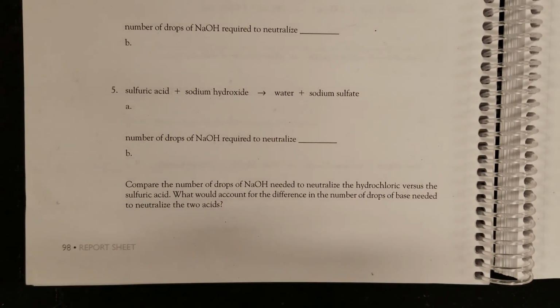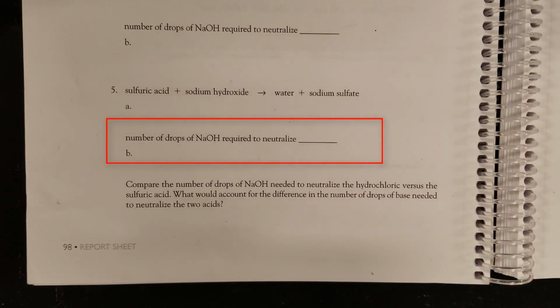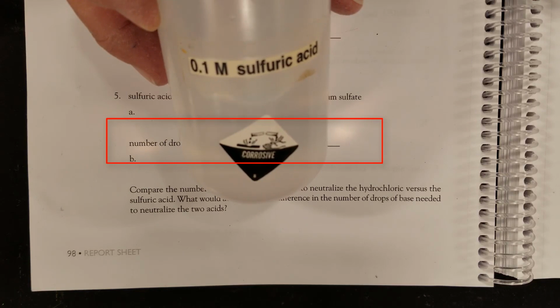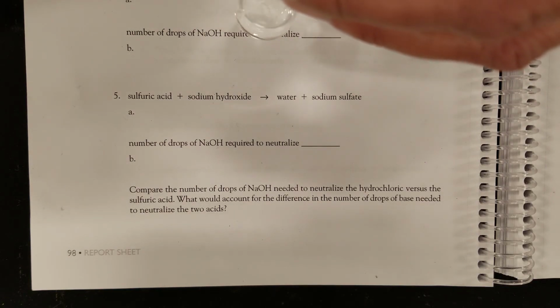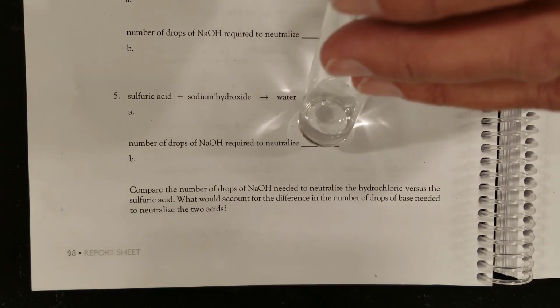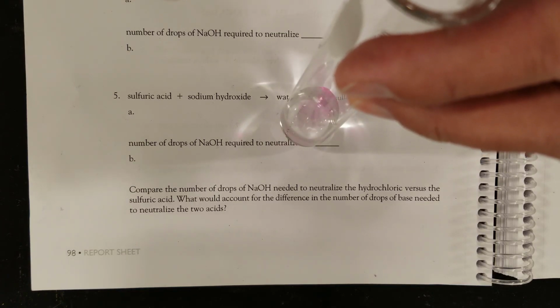Okay guys, on number 4 here it asked how many drops of the sodium hydroxide did it take to destroy the hydrochloric acid. Now we're going to do the same thing, but we're going to use sulfuric acid, H2SO4, instead of hydrochloric acid. So I got my water with the phenolphthalein, add 5 drops of my sulfuric acid. Now we're going to start adding the sodium hydroxide. 1, 2, 3, 4, 5 drops.